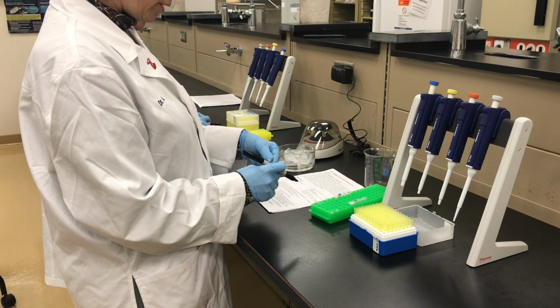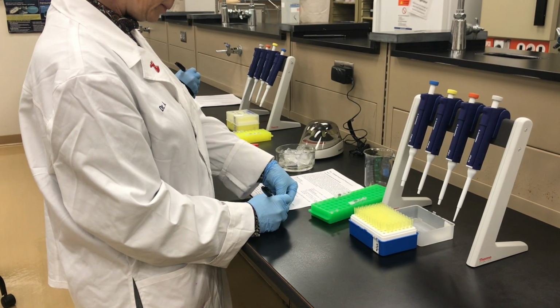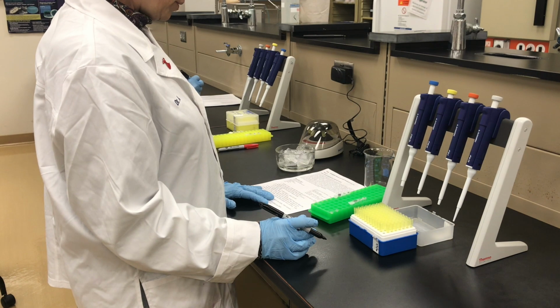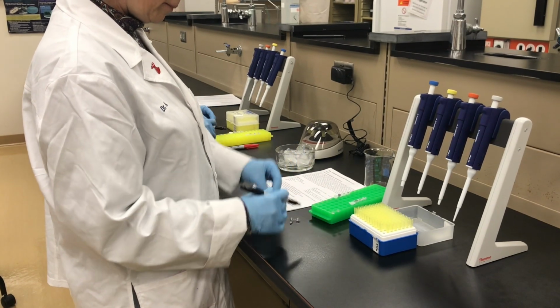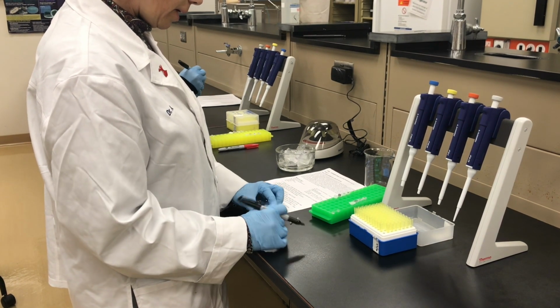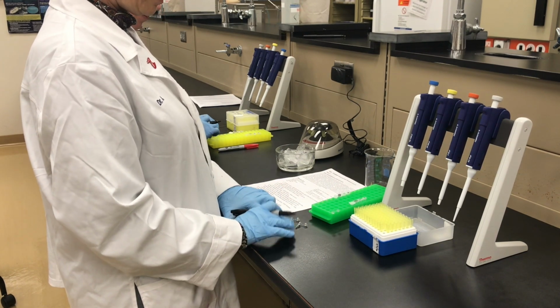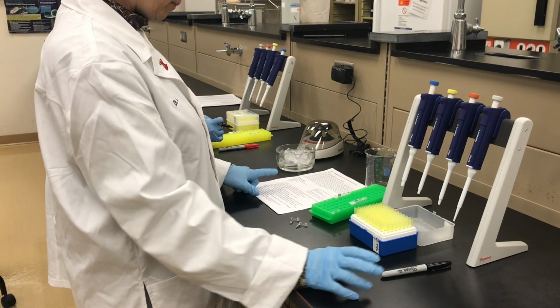We're also going to do a group symbol. I think I'm going to do a circle. So that's number 1. Put the group symbol on both of these. The second tube is 2. So I'm putting a 2 and a circle. For the small volumes, we can actually just lay them on their side. The liquid will stay in them.